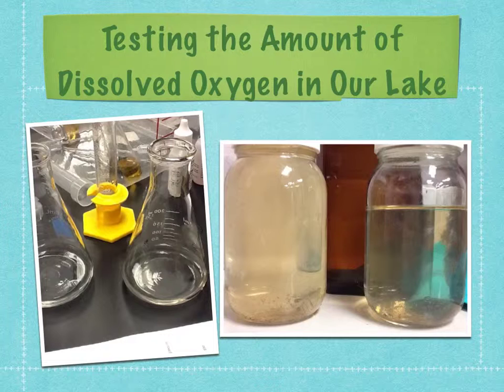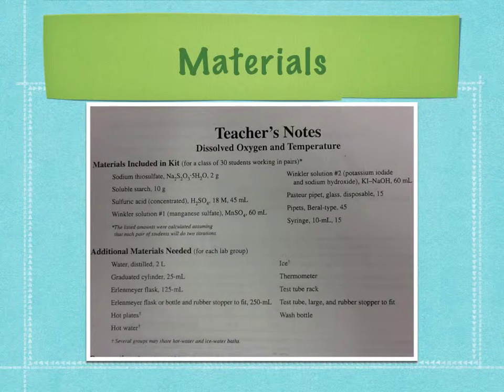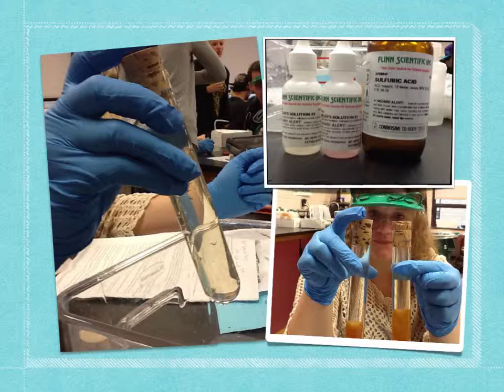We have created a system in which we are able to test the amount of dissolved oxygen in the local lake, Oakford Lake. Materials we used in the testing of dissolved oxygen in Oakford Lake include sodium thiosulfate, soluble starch, sulfuric acid, Winkler solution number 1, Winkler solution number 2, Pasteur pipette, syringe, distilled water, graduated cylinder, Erlenmeyer flask, rubber stopper, hot plates, hot water, ice, thermometer, test tube rack, test tube, and wash bottle.